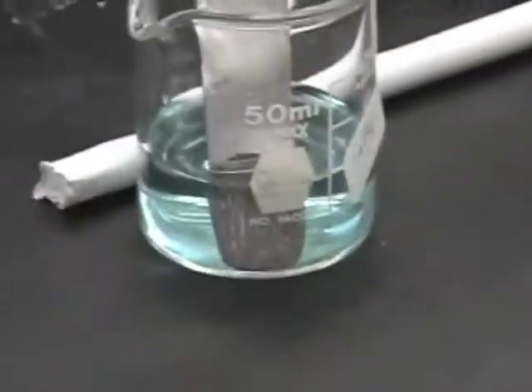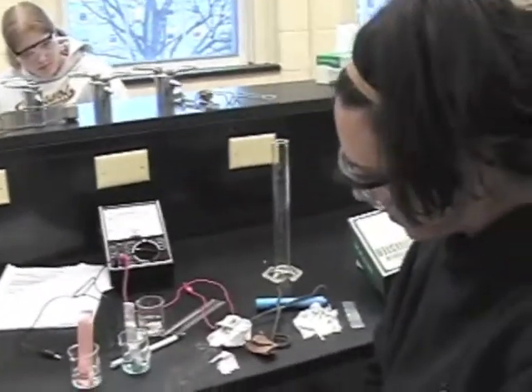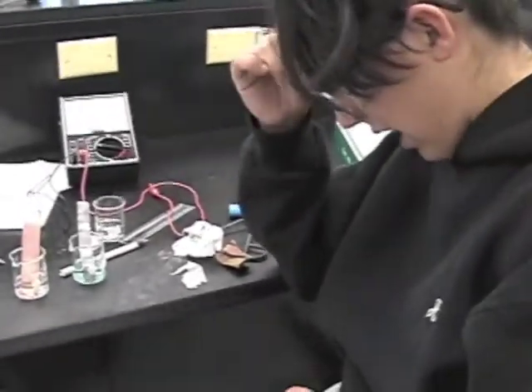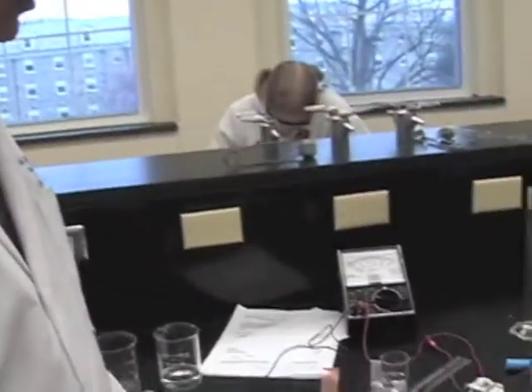So what do you think that white solid is? The white solid? Yeah. What other products would you get from that reaction? You would get zinc ions. Oh, I mean lead ions. Yes. Okay.